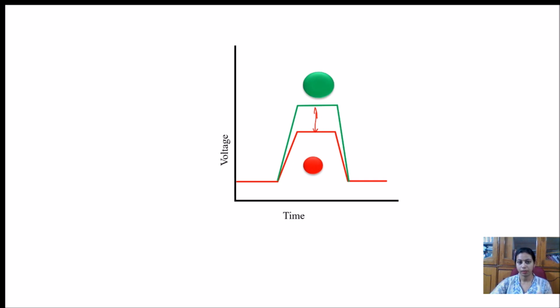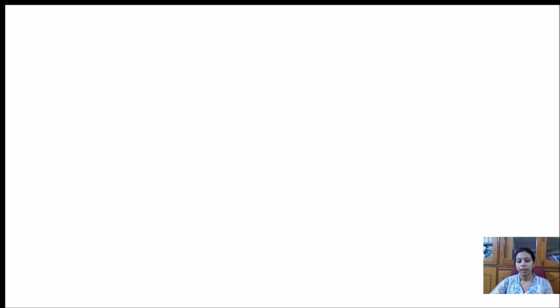So the first thing, along with the forward scattering, the FACS or flow cytometer analyzes the size of the cell. Now we know that when any particle is exposed to light, it will deflect the light at different angles. So from the forward scattering, we came to know that the size of the cells will be analyzed.